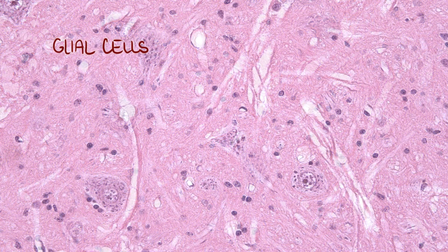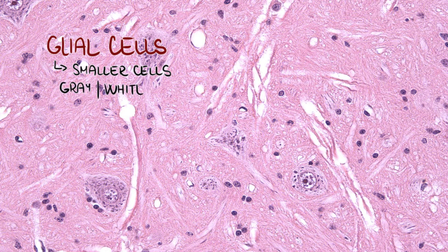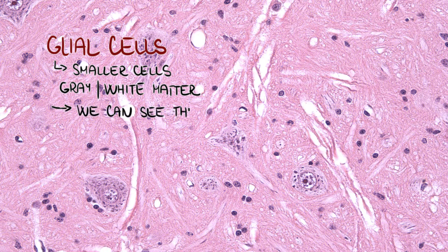Glial cells are smaller cells located in both gray and white matter. They have several functions and they look different. We can only see their nuclei in hematoxylin-eosin staining.